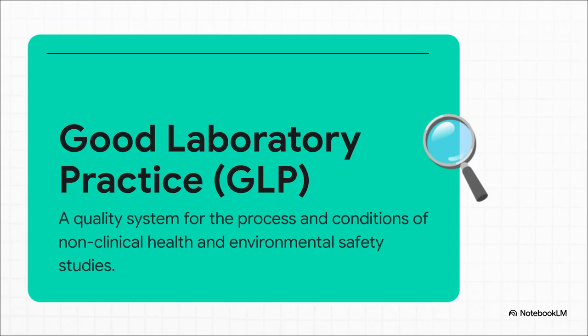GLP isn't just about the science itself, it's about the entire organizational process and the conditions. We're talking everything from planning and performing the study all the way through to archiving the results. It is a complete holistic framework.